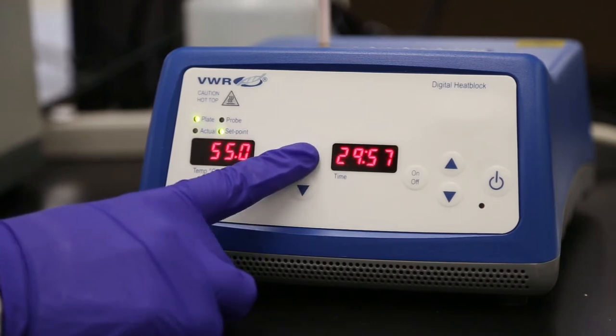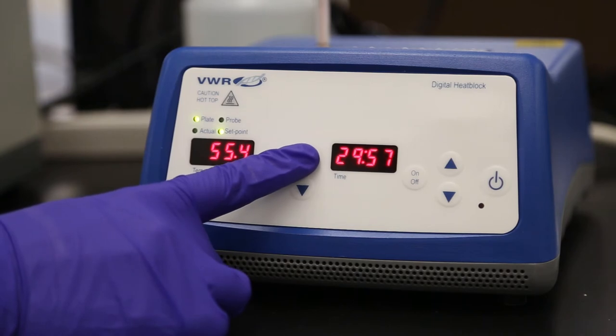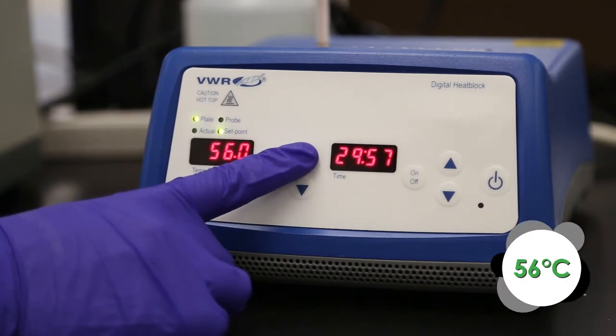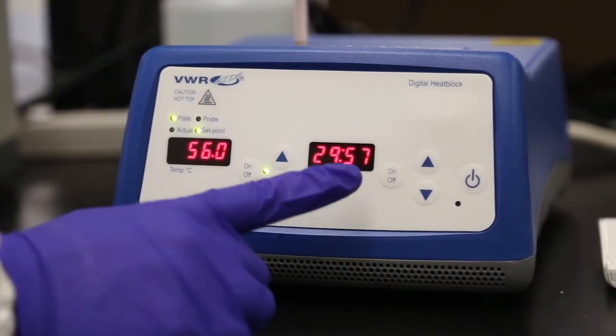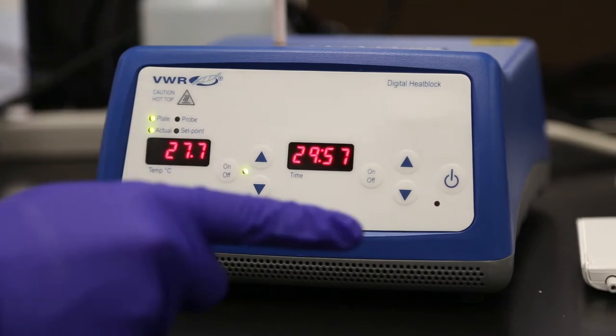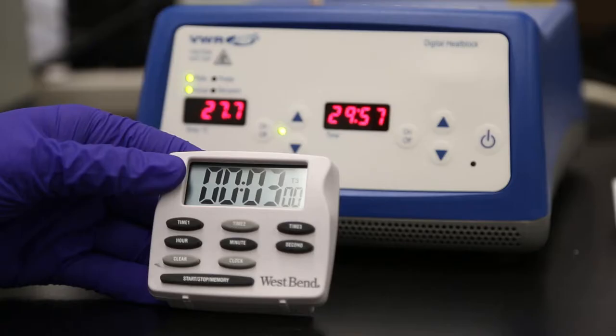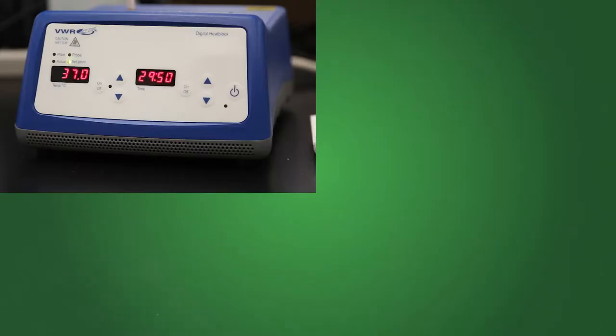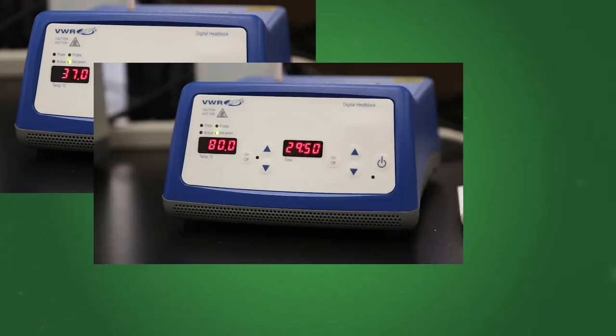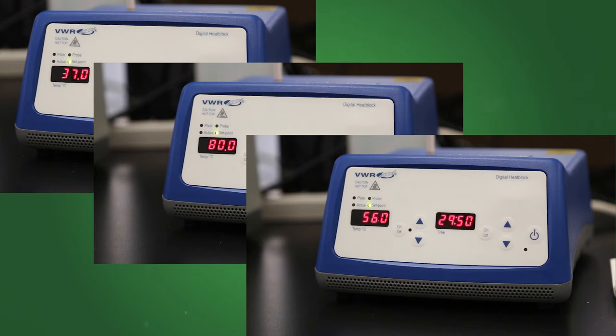To set the temperature, use the up and down arrows to adjust the display to 56 degrees Celsius. Do not use the VWR's timer when running this kit. Instead, use a timer similar to this one, set to 3 minutes. If you are using three single blocks, set the first to 37 degrees Celsius, the second to 80 degrees Celsius, and the last to 56 degrees Celsius. Remember, the green light must be on for the block to heat.